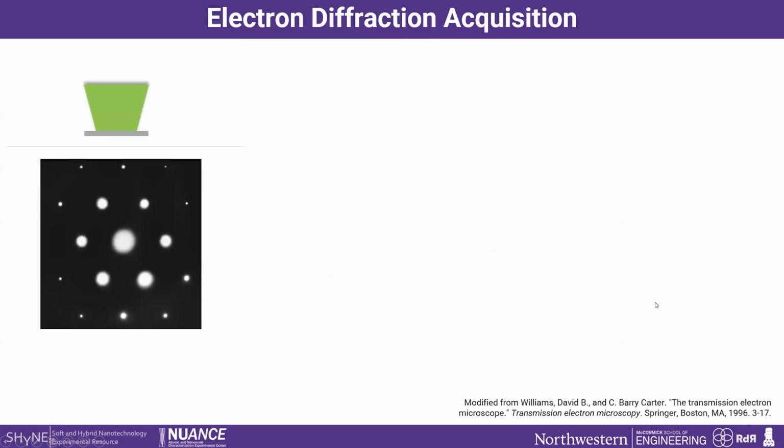So to get to that, you have to decide how you want to collect a diffraction pattern, and this basically depends on the material that you want to analyze, and on what kind of information you want. So you might want to collect in this configuration that we call parallel beam, which is so-called selected area diffraction, where you introduce a selected area aperture and produce a diffraction pattern.